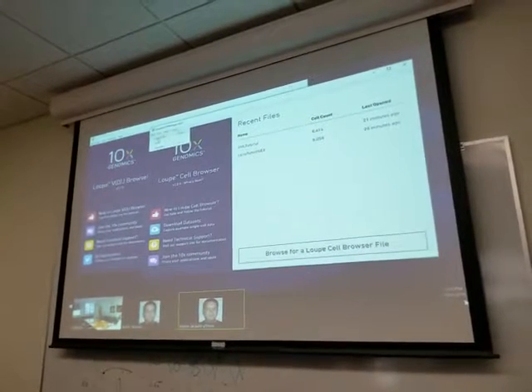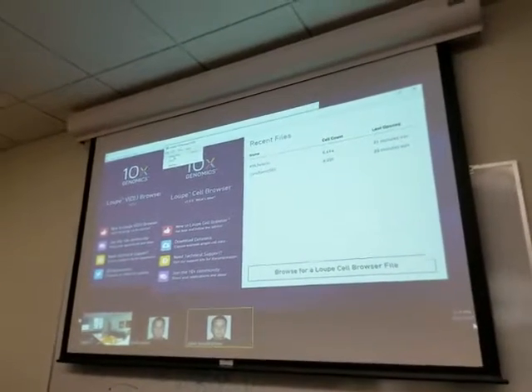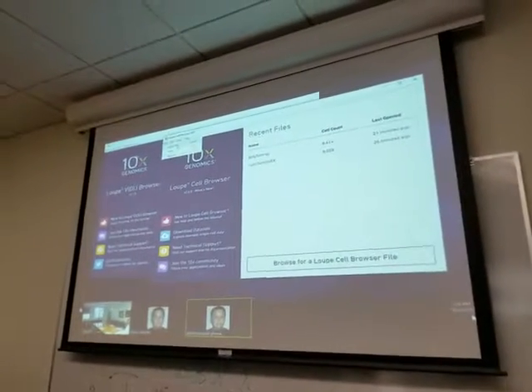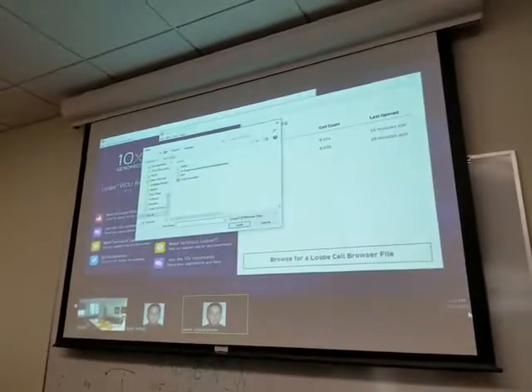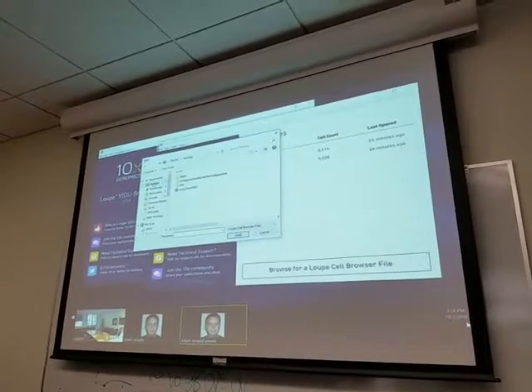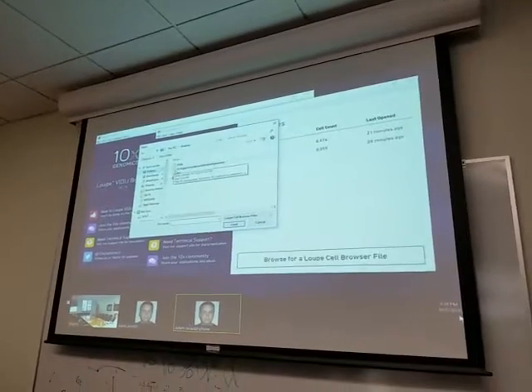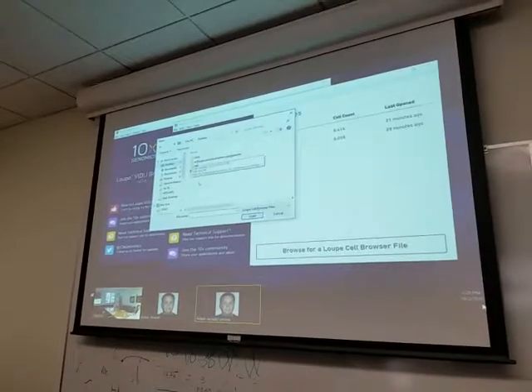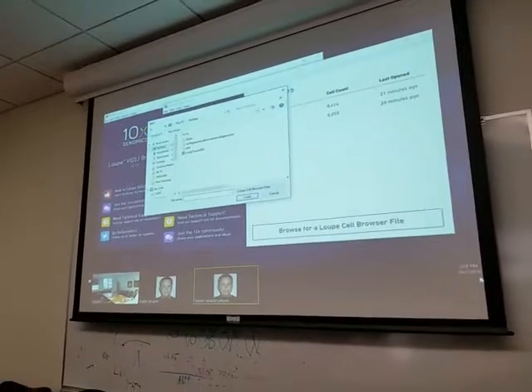So I'd have to double check on that, but I don't think there's quite the same. Yeah, that's your product. I mean, that just came out with 10X. There wasn't a way to do it before, a good way. So what do people do? I mean, we have a few people all suggesting different things. What can people do? What's the next step? I don't even know what the next step is. A common program that might be the first choice. Yeah, honestly, I'd have to double check what people are using.